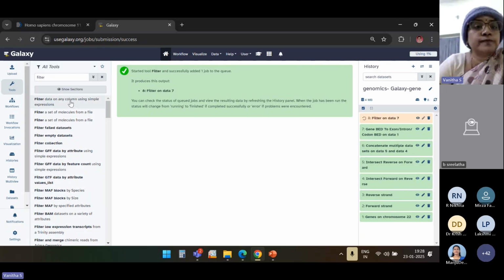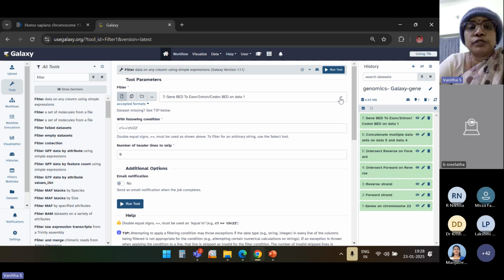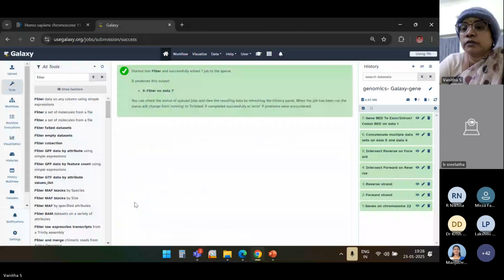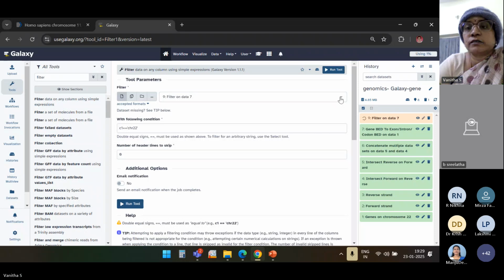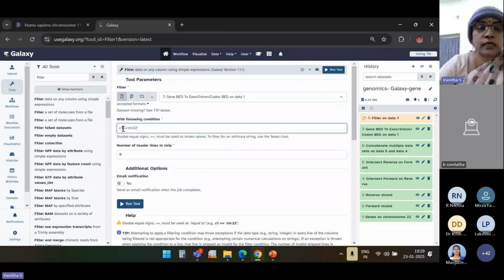What did I do? Okay, so this one I will delete. So what you're supposed to do is what you have taken, gene bed, but we didn't change the column, right? So what is the column you have to take is plus. Okay, then you can run the tool. So you will be getting the forward strand.